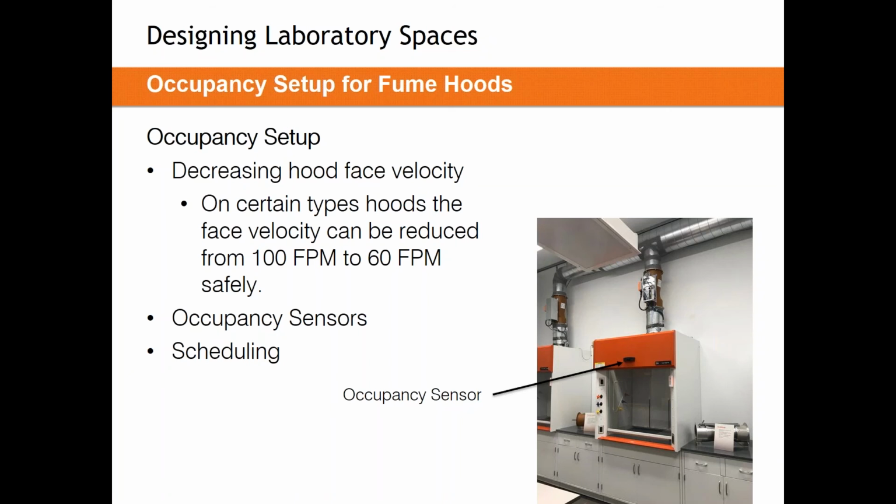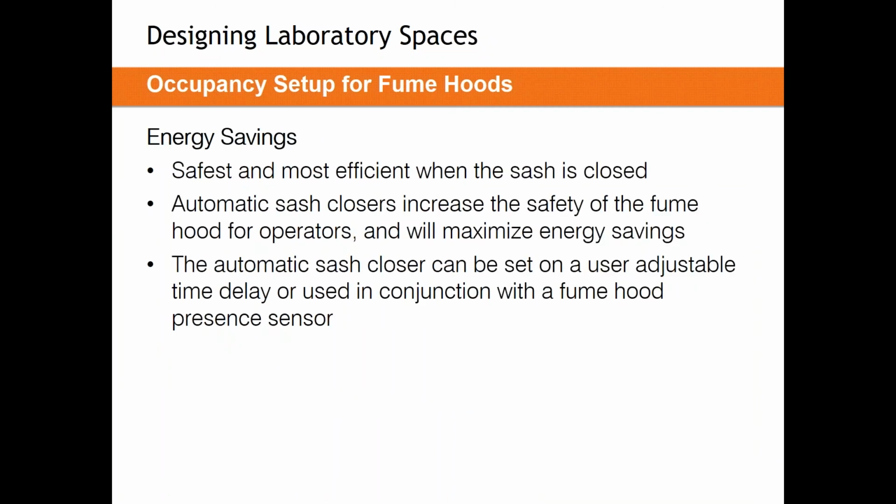The people that have control of that are the end users that work in front of those fume hoods and the supervisors that work with all of these groups. The best way to keep a safe and efficient fume hood is to train people to close it at the end of the day. Occupancy sensors work. There's no problem with applying them. But the best thing we can do is train people to close those hoods. There's a few ways to deal with this.